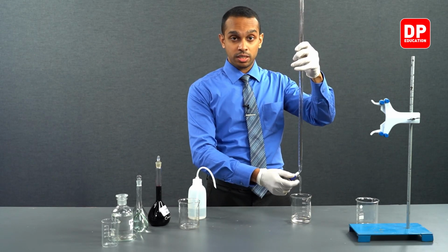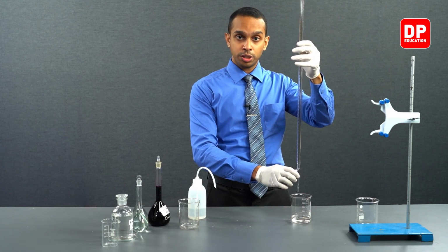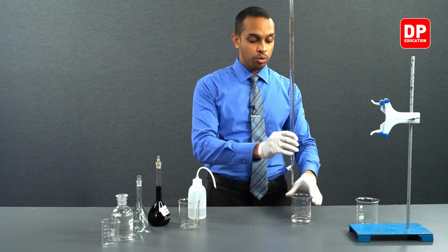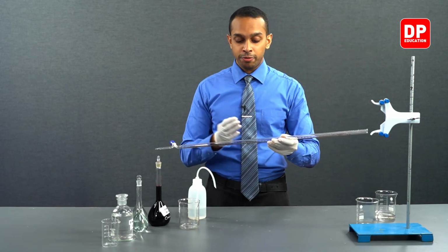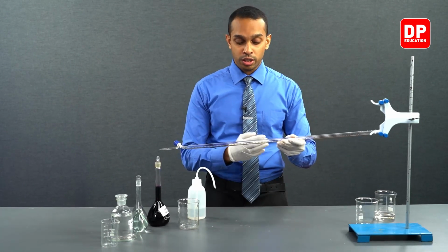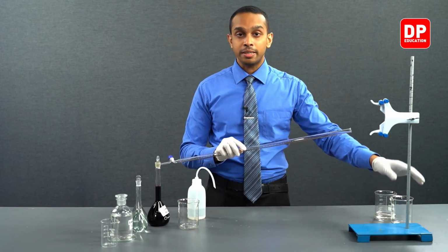This is just the first step. After using water and washing it, we will have to use the solution that is going to be filled into this burette and wash this burette again with that solution. So let's move on to that.